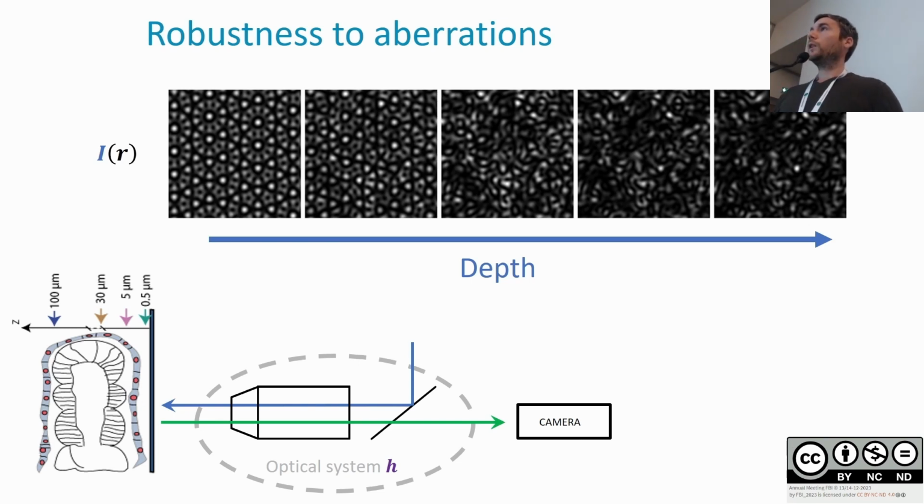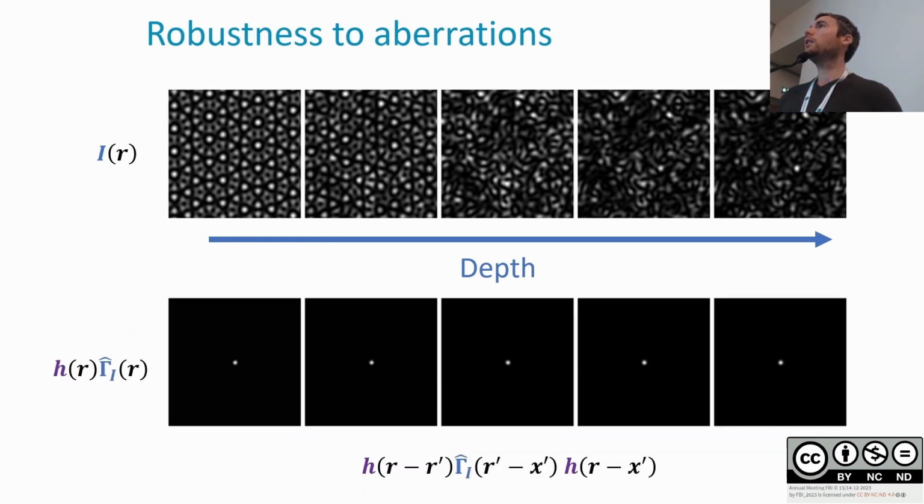So first thing, I've looked at the statistical property I was mentioning, so the typical grain shape of the speckle. And actually, we have to choose this illumination so that it's similar. So for all this kind of illumination, this one we have perfect control, this one is totally random, it's always the same average grain size. This is the input of the algorithm. So you can use always the same algorithm, whatever the illumination you have.